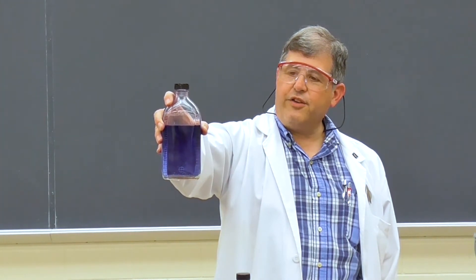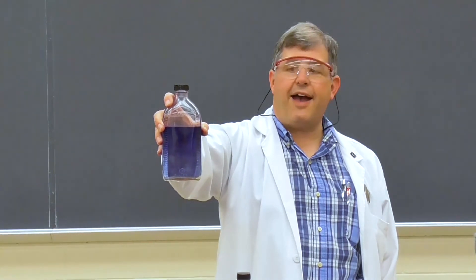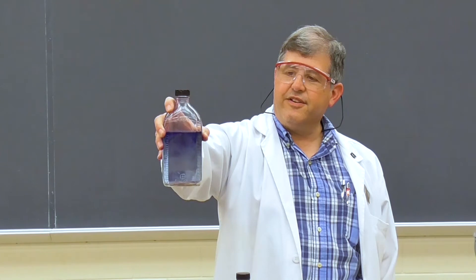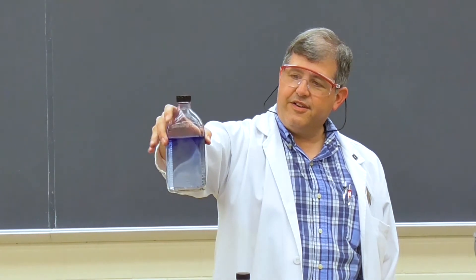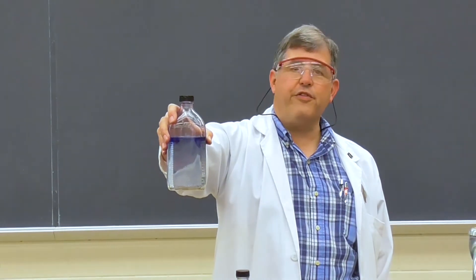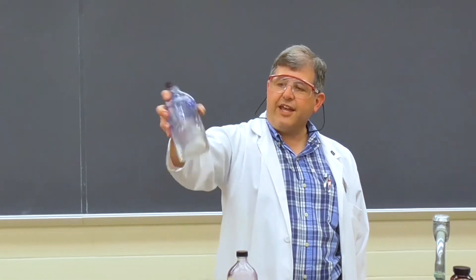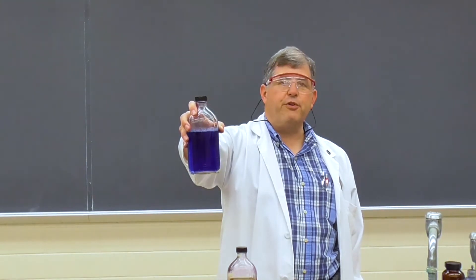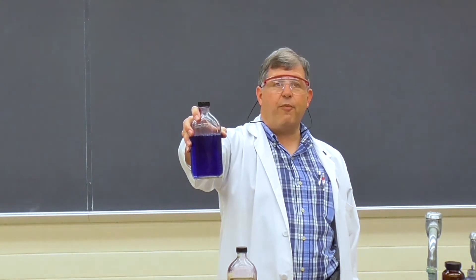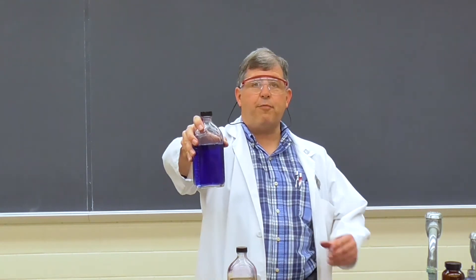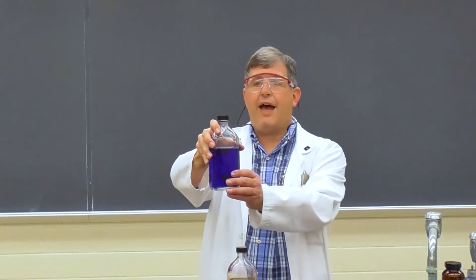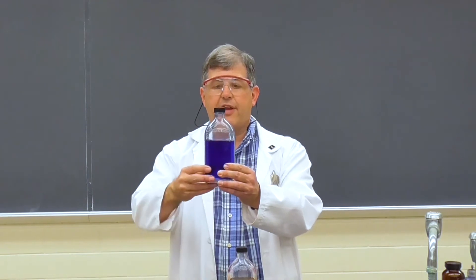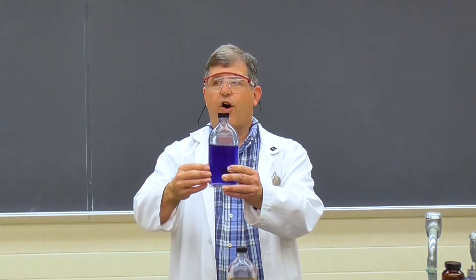You can see it's starting to go back to colorless — the blue is almost gone. If I shake it again it turns blue, and if we let it sit it'll go back to colorless. It'll keep oscillating back and forth between blue and colorless.